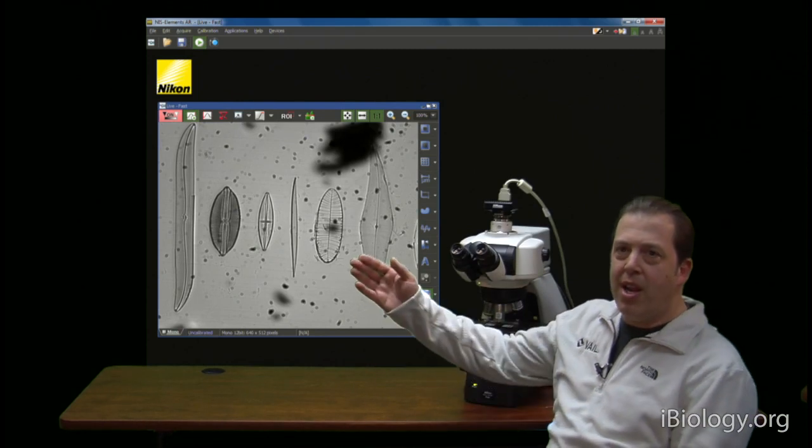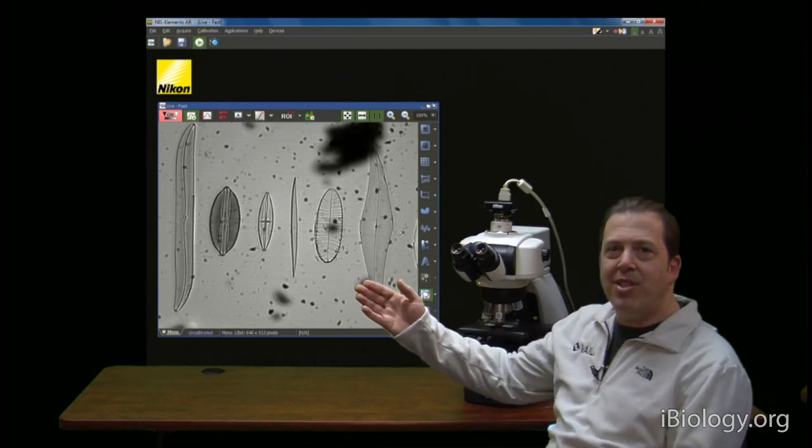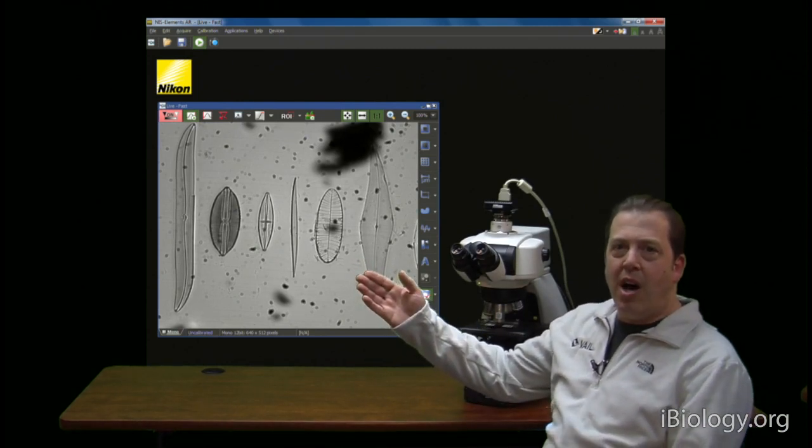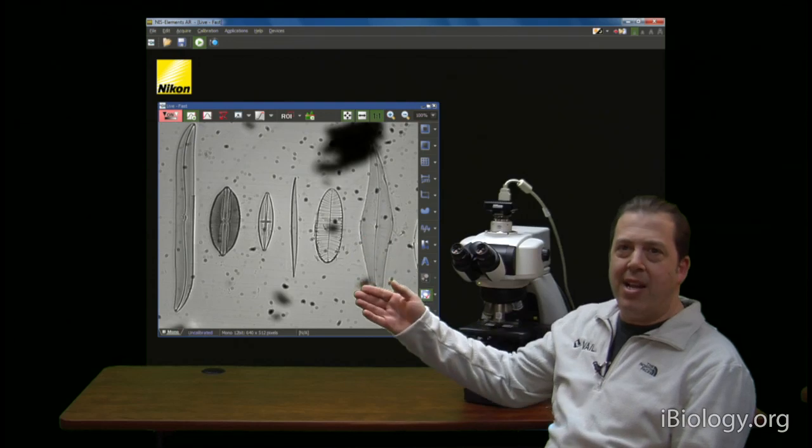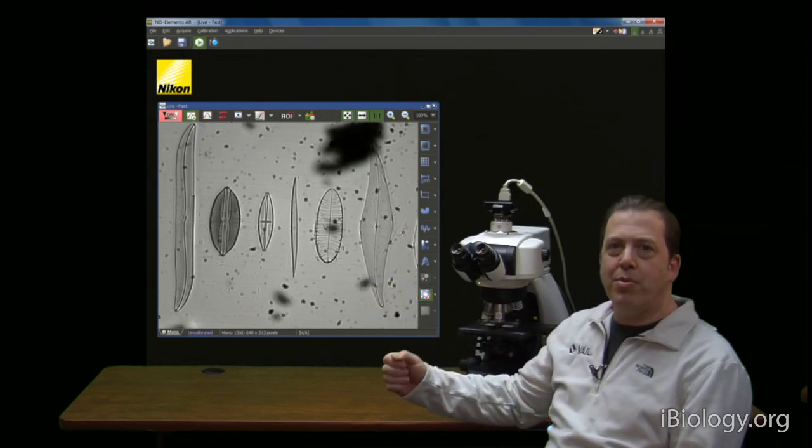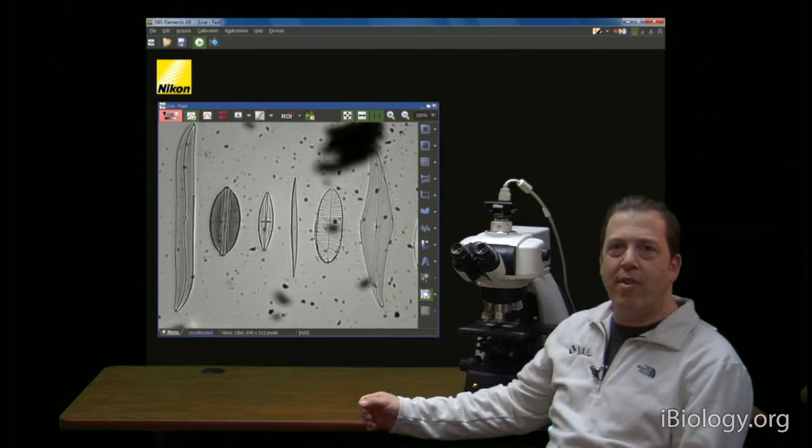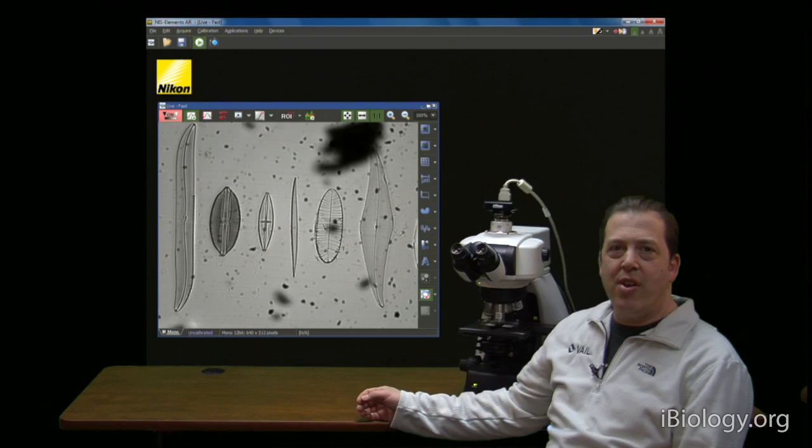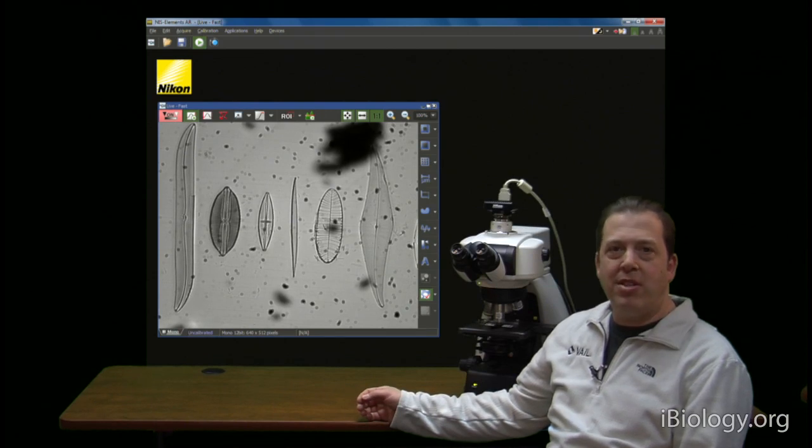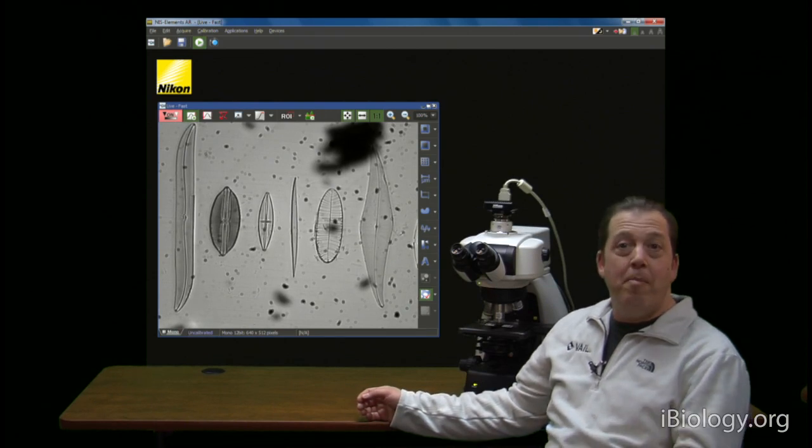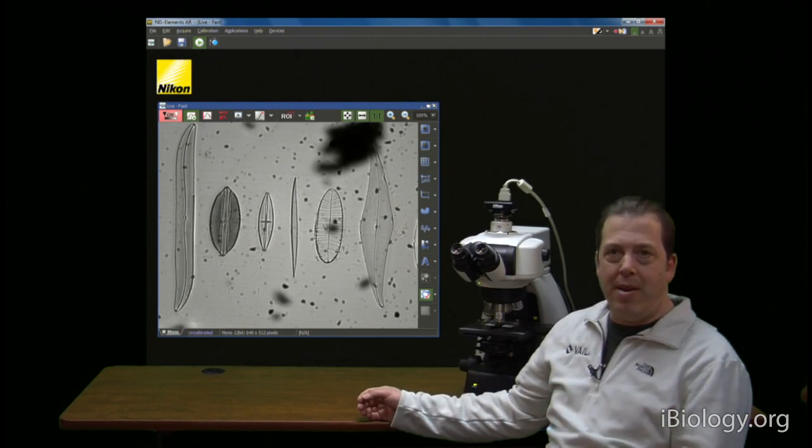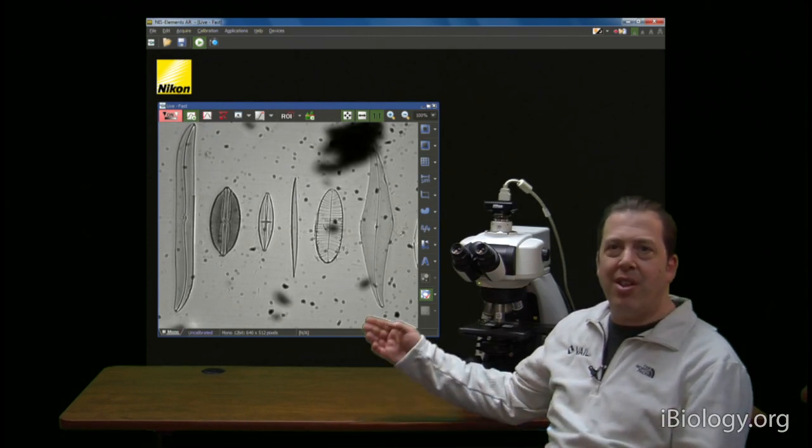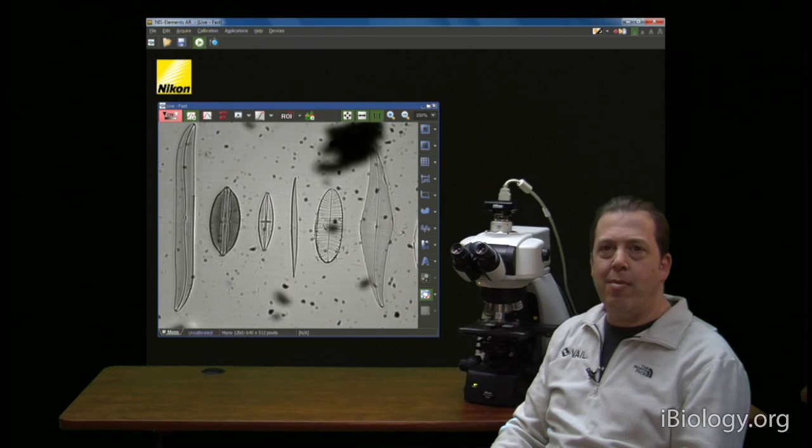So you can see right here I have a microscope image and this is a lineup of diatoms on a microscope slide which are very nice because they're transparent and you can see them by contrast. There should be a nice clean white background on this slide but you can see that there's an awful lot of dirt in this image.